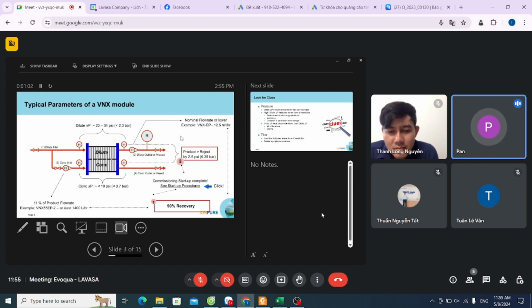When you turn on the power, it will regenerate. It will bring up the quality, and you show the user, okay, this is the performance of the module. Are you happy? If he's happy, then he can use the water. So it's very simple. Only 2 things that you need to do. All right.